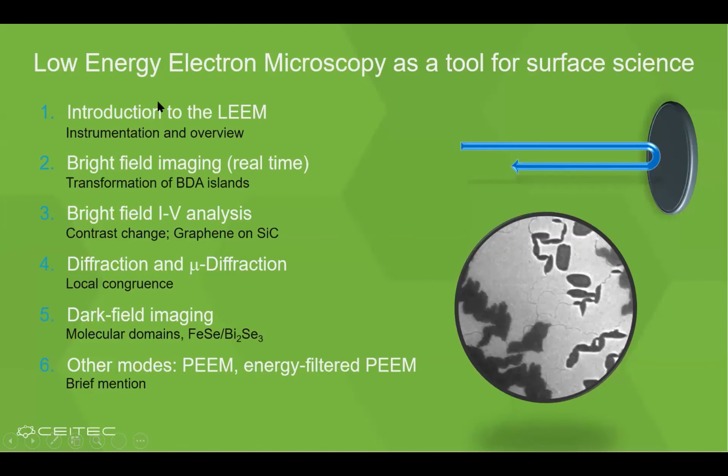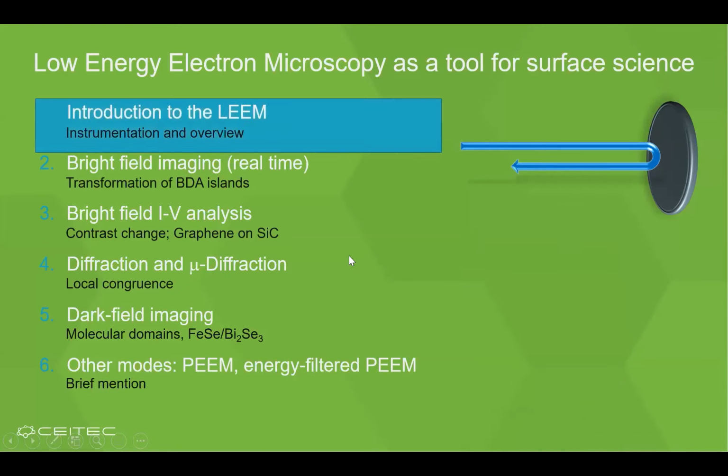So I will introduce LEEM briefly, then I go to the sub-techniques of LEEM, like bright field imaging, diffraction, and dark field imaging, and you will really see that this instrument is worth considering for your studies.